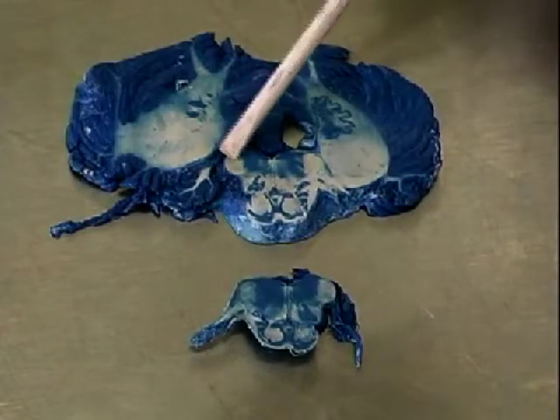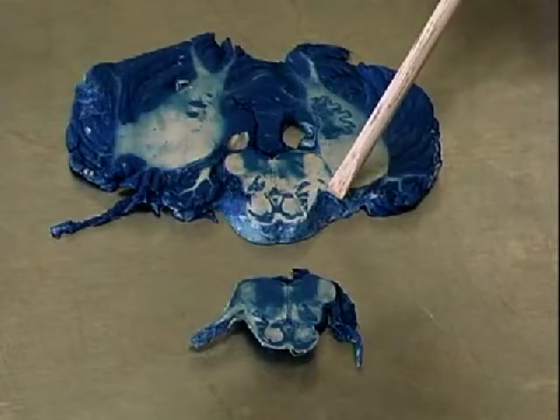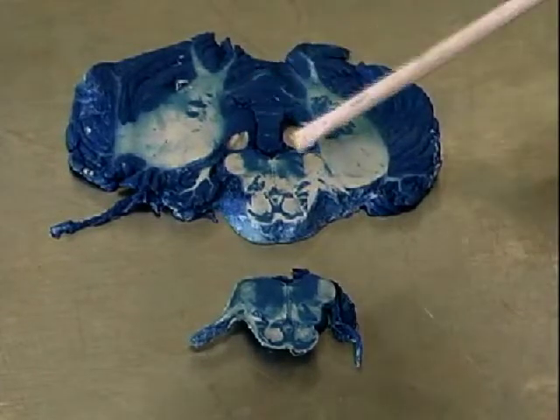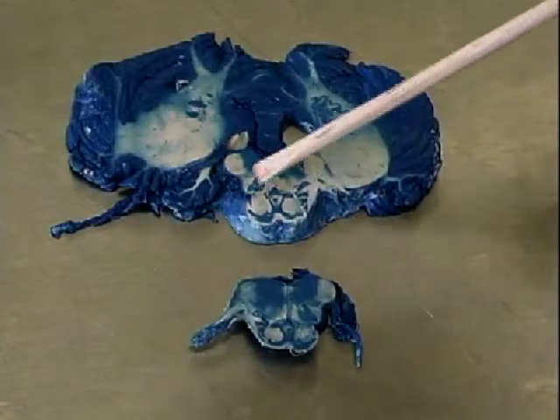So again, here's the inferior cerebellar peduncle. Here's the auditory part of the 8th nerve, the vestibular part of the 8th nerve. What else can we see? We can see some olive here. You can see some pons beginning down here.